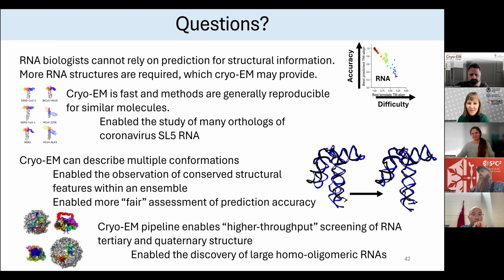Okay. Another question: you've explained the advantages of cryo-EM for RNA structure very well. Do you see value in pursuing very high resolution crystal structures for very small RNA fragments, and using what we learn from cryo-EM to help us pick those tiny fragments?